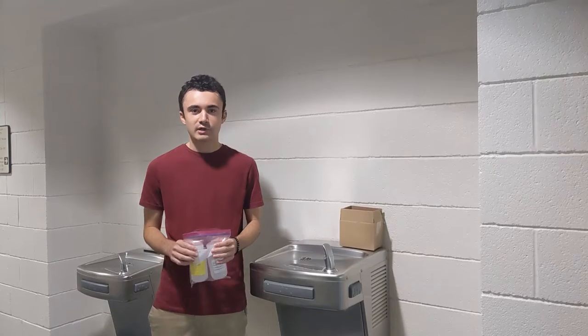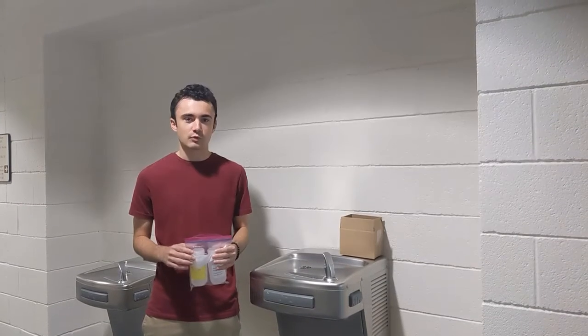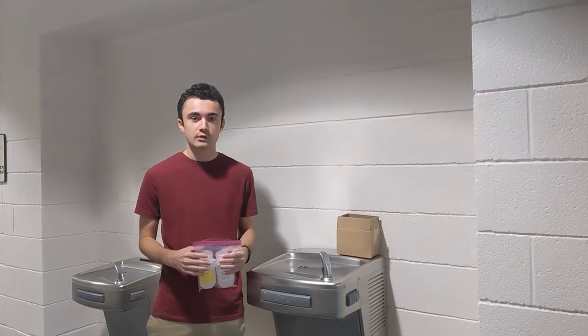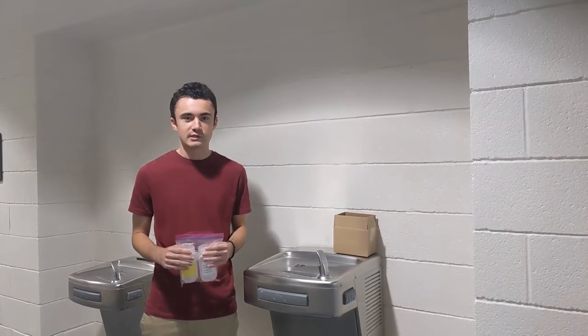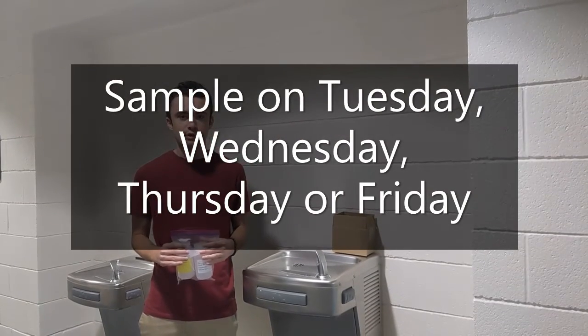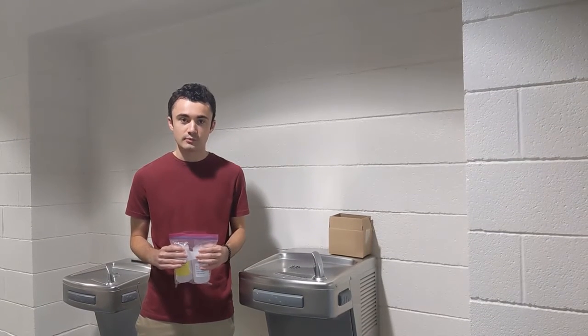Samples should be taken after 8 to 18 hours of stagnation, which means it's best to sample your water bottles in the morning after nobody's been using the water overnight. And additionally, it's best to sample on Tuesday, Wednesday, Thursday, or Friday to avoid a Monday sample in which water has not been used over the whole course of the weekend.